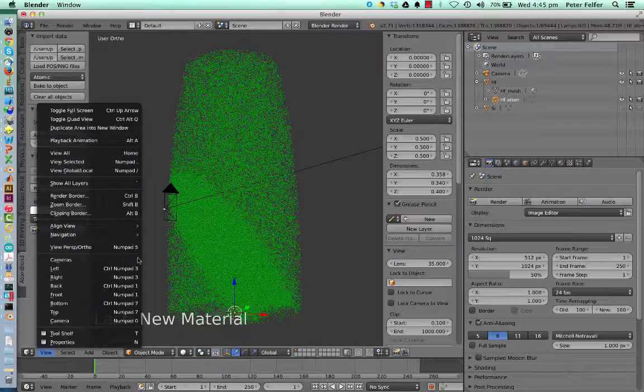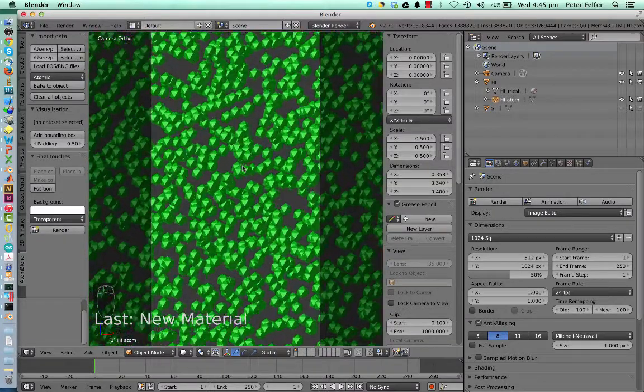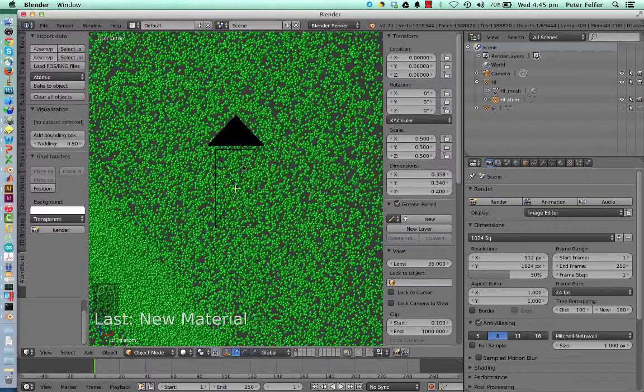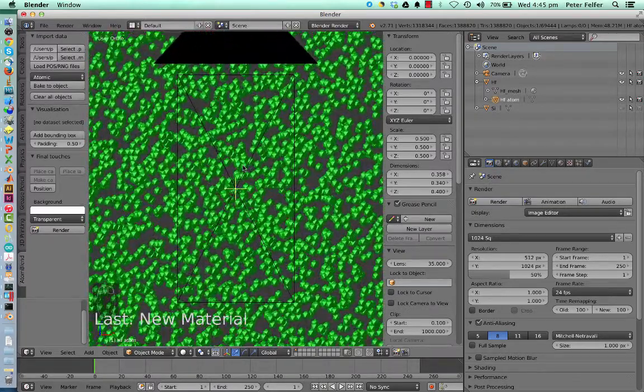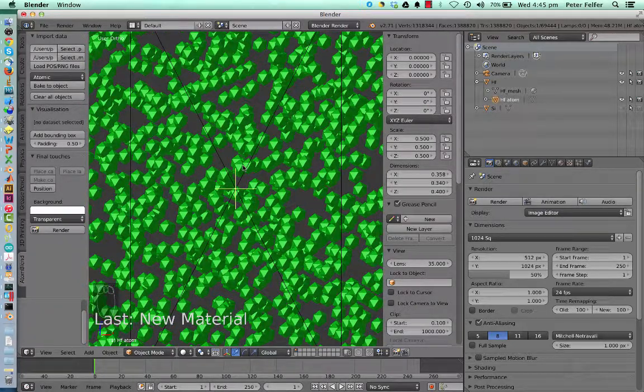camera view, you can see that we can actually see the different facets because it's called an icosphere. It's essentially an icosahedron, but it also means that there's not too much geometry. So we're minimizing the amount of geometry, and we can change that by using a so-called modifier.